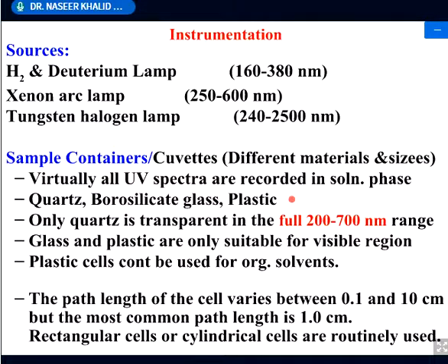Out of these, only quartz is transparent in the full range, for example 200 to 700 nanometers.